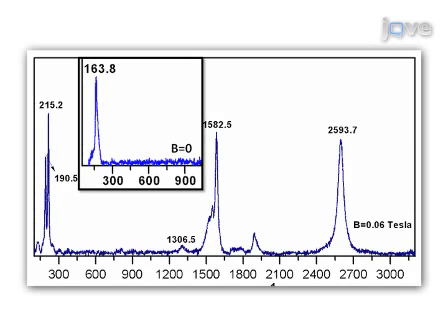Here is a Raman spectrum of samples in a range of 100 to 3100 per centimeter obtained with a magnetic field. The inset is for samples without a magnetic field around radial breathing mode frequencies. The intensity of the 2D peak over the intensity of the G peak is utilized to estimate the thickness of graphene layers. This spectrum produces an intensity value of around 1, which represents that the number of graphene layers is around 2.